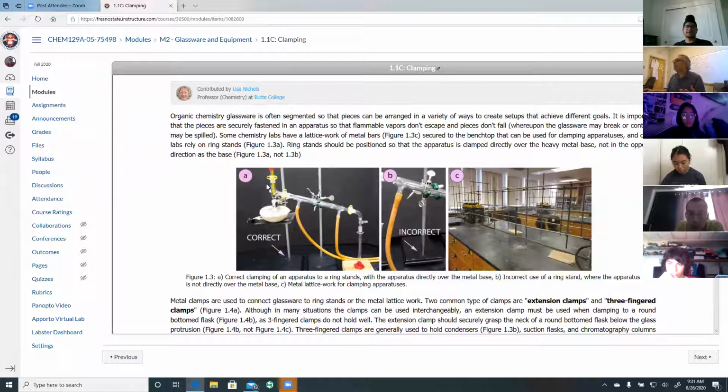If you attach this whole glassware setup, round bottom flask, distillation head, condenser, vent adapter, and the thermometer, and put it on C, and clamp it using the monkey bar here, these monkey bars are much more sturdy and they're not going to move. Even if you accidentally run into the monkey bar end on the right side, this part of the monkey bar is not going to be moving or get disrupted to affect the location of your different glassware.